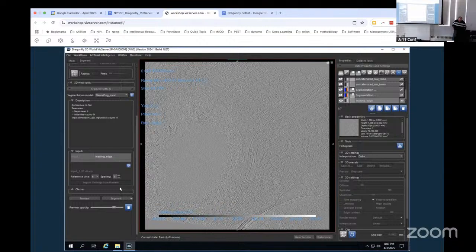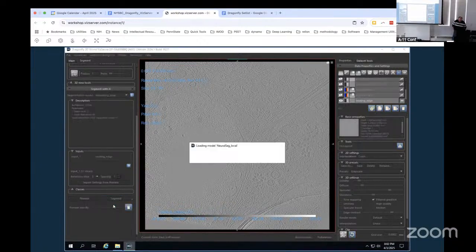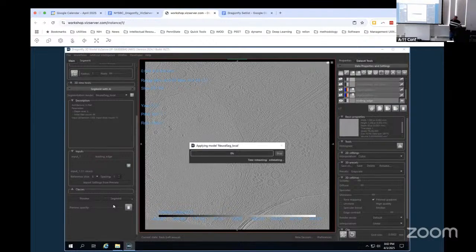Whatever, the point of this is just that this network finds more things. It's better. It's just trained iteratively on a fair amount of data. But just to give you a sense, I still think it's not that great a model. Like I say in the paper, someone's going to make something way better soon.